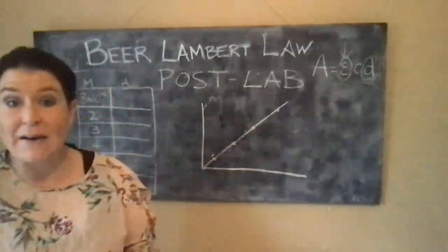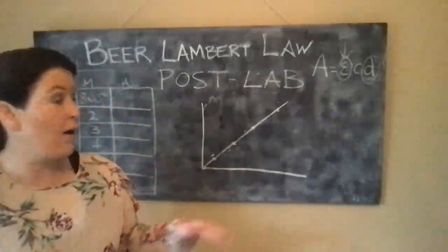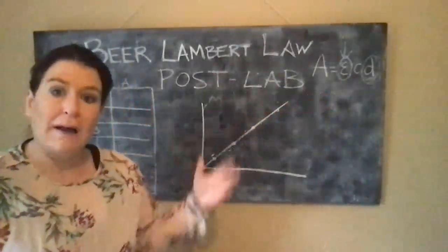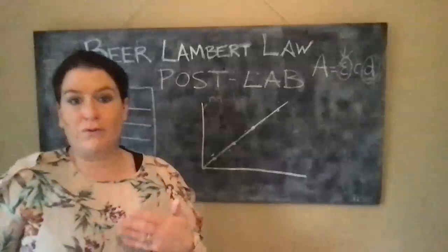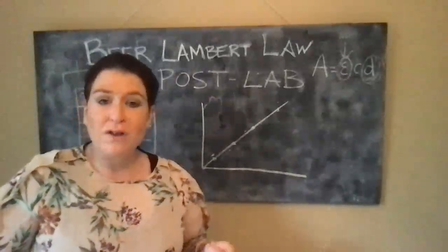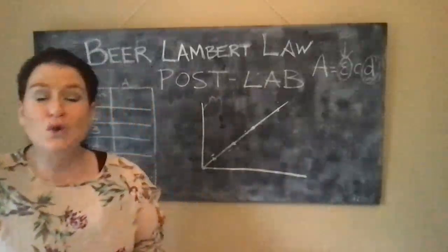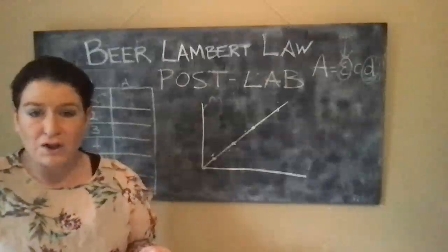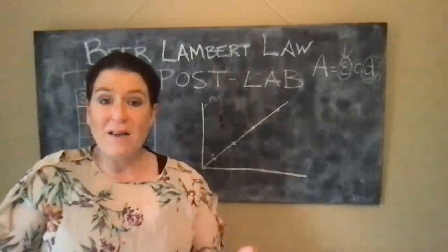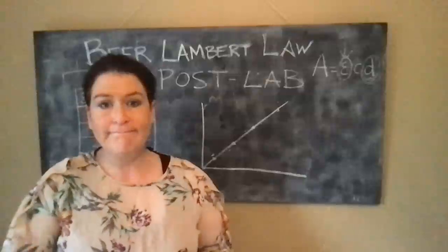So, you can point out human error. That's perfectly acceptable. It doesn't mean you failed the lab. It means you recognize that these aren't sitting ideally on the line, and that doing it over again, maybe you could pay a bit more attention to how you were doing it. But if you're not sure of how to do this going forward into other labs, do make sure you concentrate on watching the lab as it has been performed by the technicians in the videos that we're posting for you going forward. Best of luck.